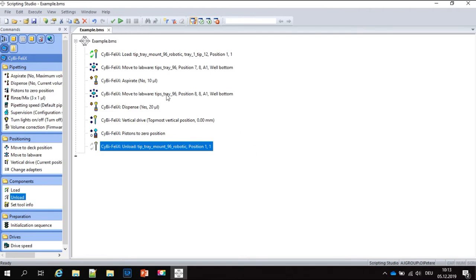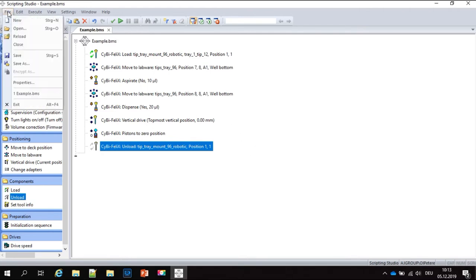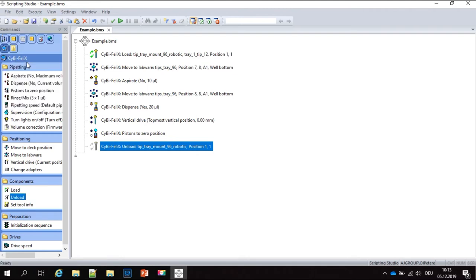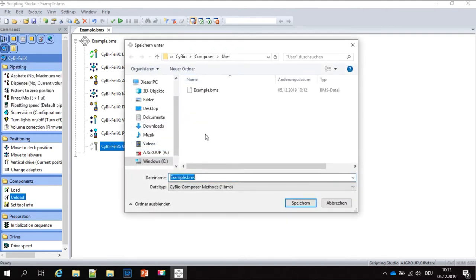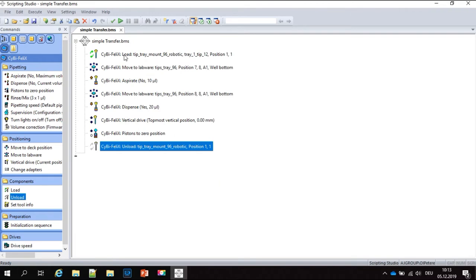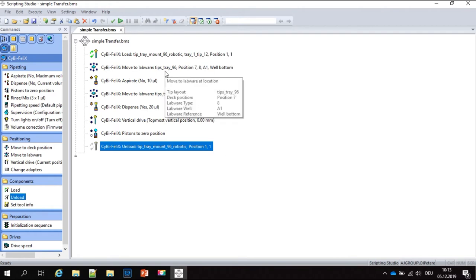You can save your program by clicking File, Save As, selecting the folder, and giving it a name — in our example, 'simple transfer'. Once saved, you can execute it directly from this workspace, or include it in the application studio to run it in an easy way.